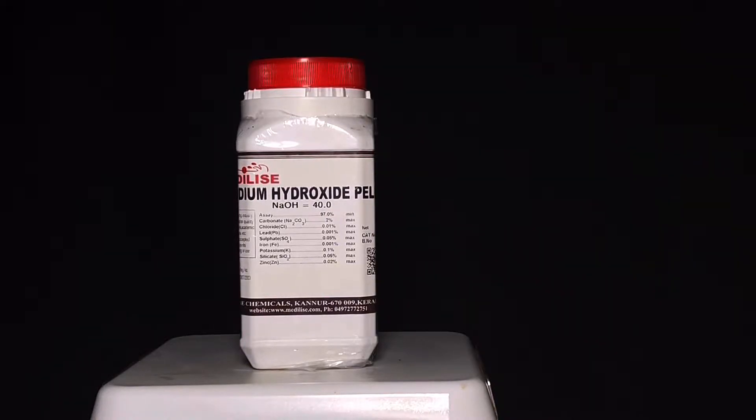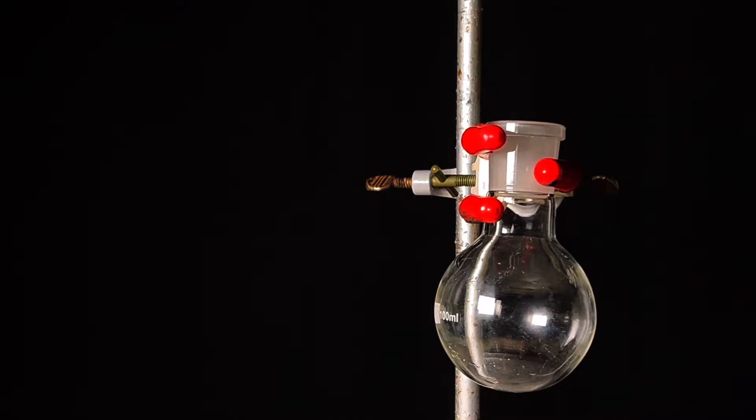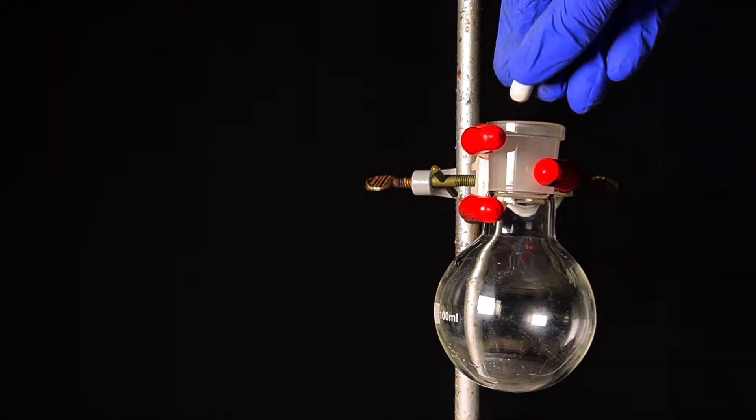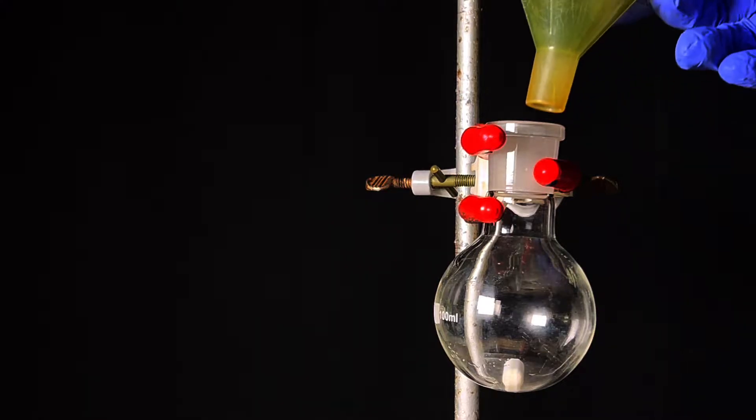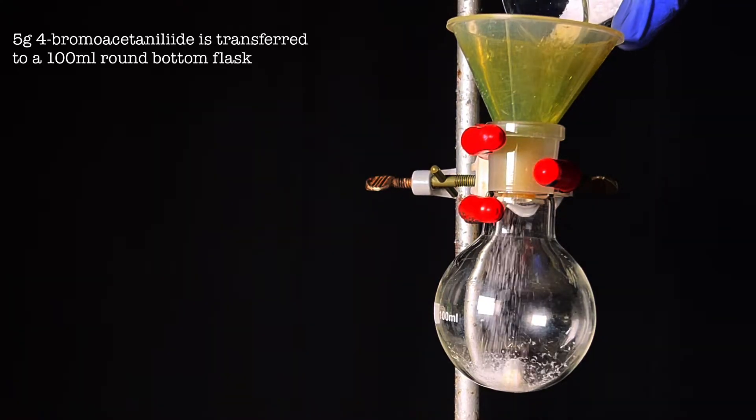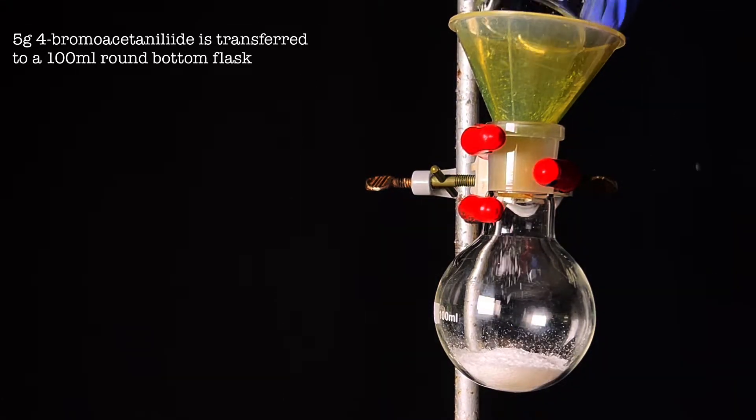A 100 milliliter round bottom flask was fixed onto a stand using a clamp. Using a powder funnel, 5 grams of parabromoacetanilide is transferred to the round bottom flask.